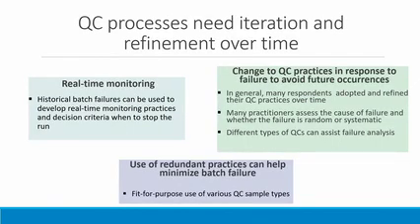So to recap, the main findings from this interactive forum were really that the QC processes were refined in labs over time. So I think following up on what Bob was saying, after finding failures or causes for failures, additional QC strategies were added to try to address those, and when possible, those were included as real-time checks to make sure everything is running okay, and the use of redundant practices, as we saw also from Tracey's presentation.